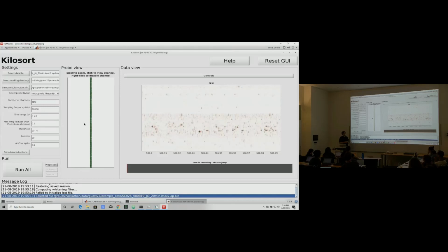It's very strange. Can you change it to 385? As soon as it just finished saving, yeah. So it won't let you change it to a file that's not a multiple of 385. Okay. No, it won't let me change it. It says guessing that the number of channels is 410. Okay. If it doesn't look right, consider trying 410 or 416.